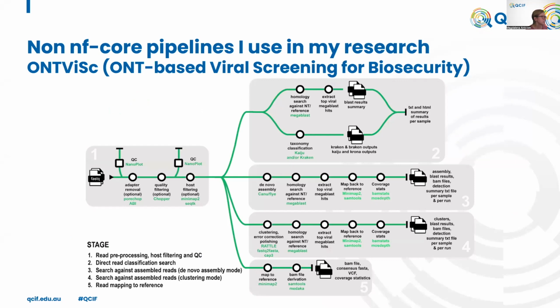And finally, the pipeline that I also use, that I developed, I tested, so I was involved in developing it, together with Biocommons support, is ONT-VISC, which is an ONT-based viral screening for biosecurity pipeline. So it also has several modules. It's not as big as the NeoPy.